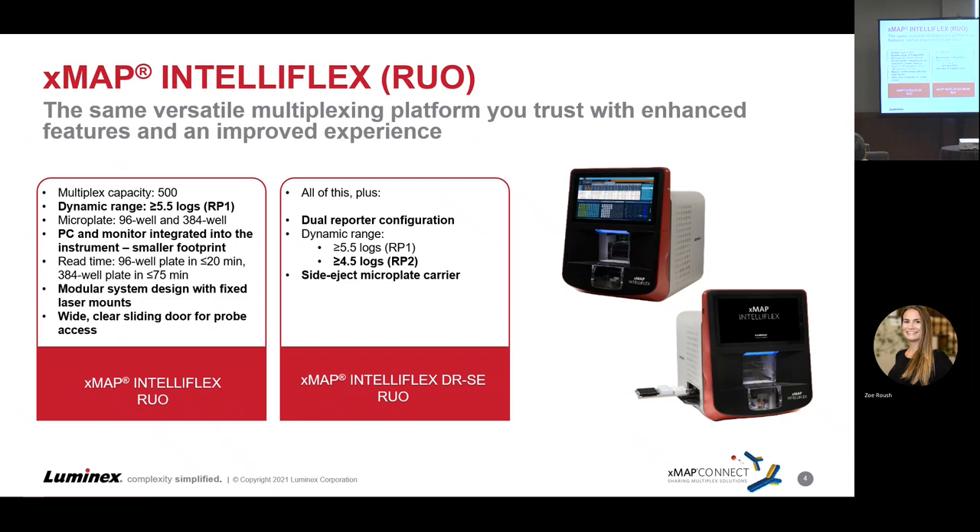That's maybe part of what took 11 years to get the design much better dialed in based on what we've been doing in the past. So that's just the IntelliFlex RUO — the base model — but you can also see at the bottom that we have the side eject dual reporter feature as well.